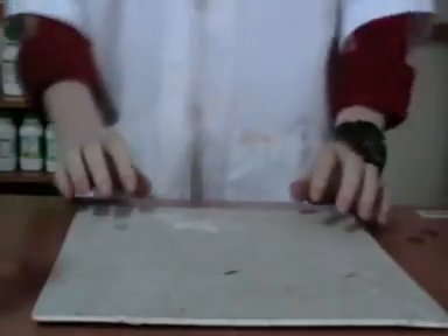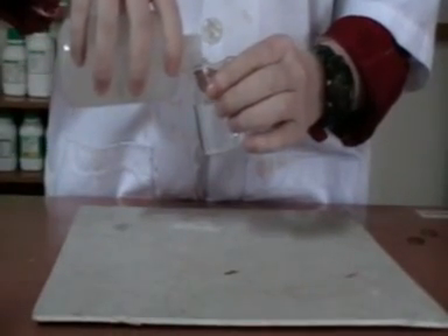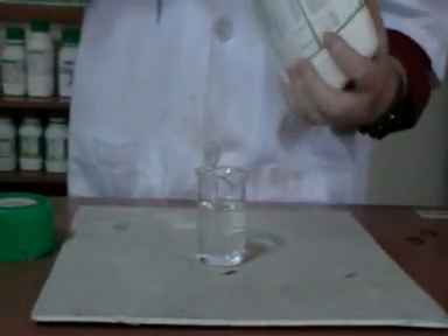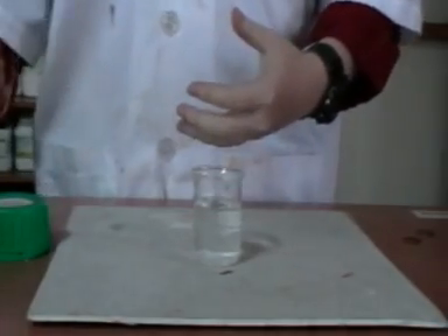We start now using chemicals - this is potassium hydroxide and zinc powder. First, we prepare the potassium hydroxide solution. We add some water to it and then a few drops of potassium hydroxide.